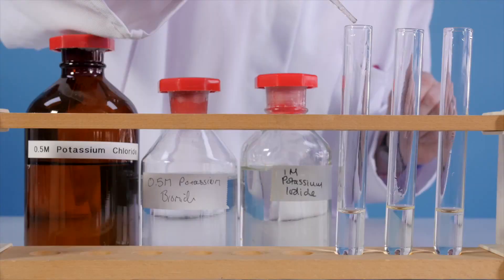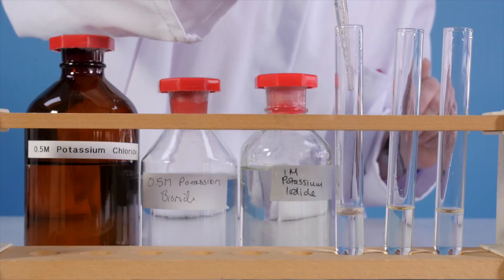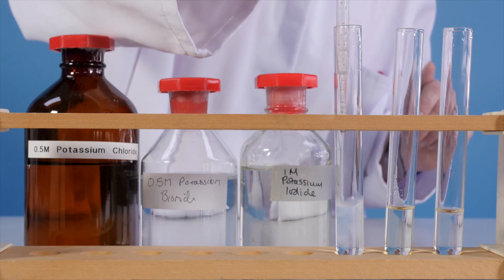Using a pipette, add dilute nitric acid to your samples, followed by about two centimeter cubed of silver nitrate.